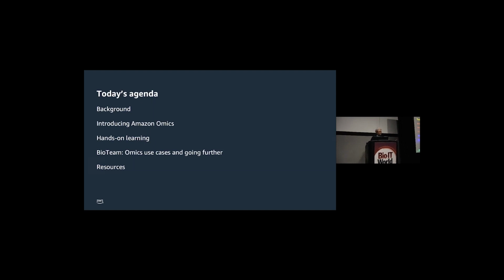All right, so we're going to introduce what Amazon Omics is. We're going to do that hands-on learning. So laptops out. This might work on an iPad. I haven't tested that out, so good luck. And then we'll have a little bit of commentary from BioTeam, and then wrap it up with some resources to learn more.